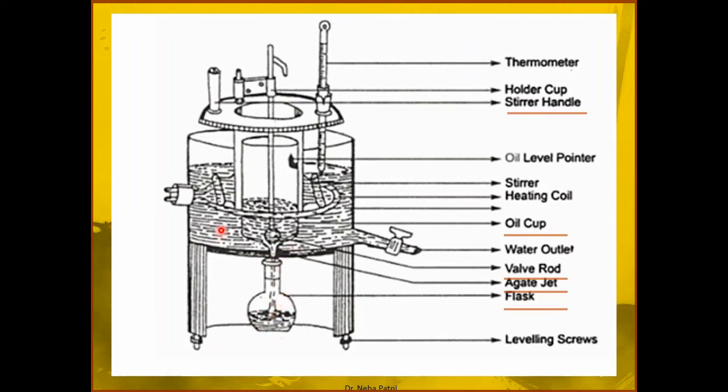Now, outside the viscometer you have to fill water, because you are actually heating water and that heat goes inside. So we are not directly heating; you just have to plug it in, and the water gets heated due to this rod and the temperature rises inside. Here you have to take a thermometer also in order to note the temperature.